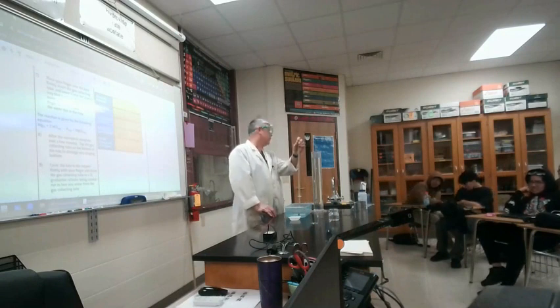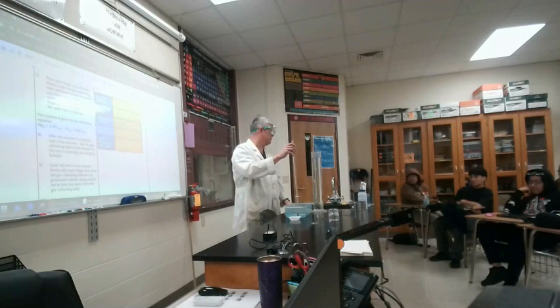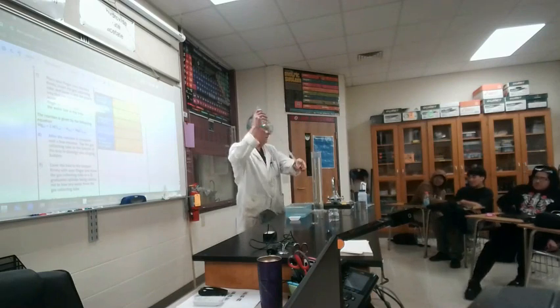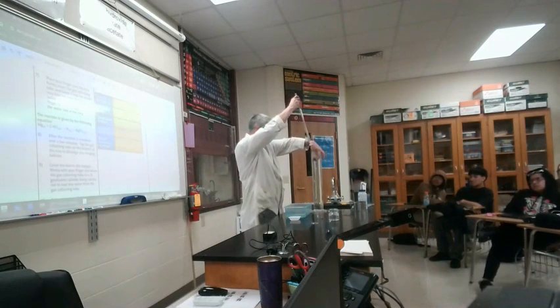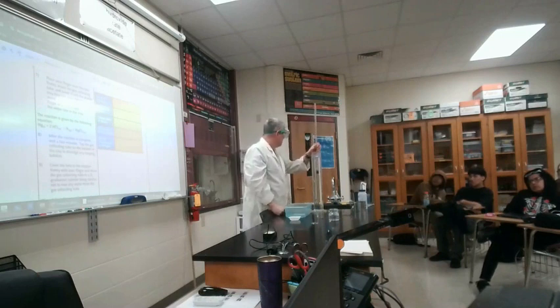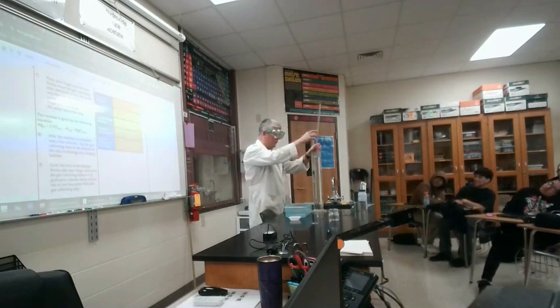But I can show you what we would still do, which is at this point, tap it. Get all the bubbles to the top. I'm going to put my finger over the bottom, bring it over here, and hold my finger on the bottom until it's under the water. Then I can let go. It pushed out all the water here, but there will be some left in your tube.